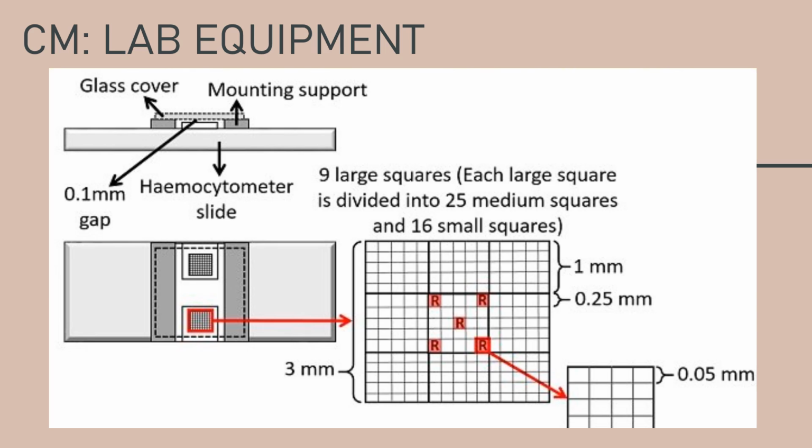Moving on, this is an illustration of the hemocytometer.